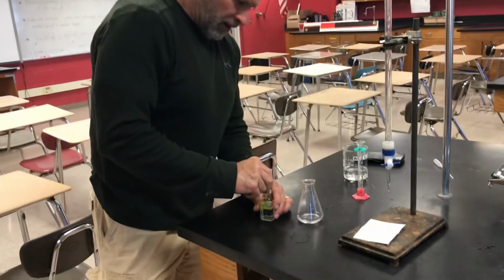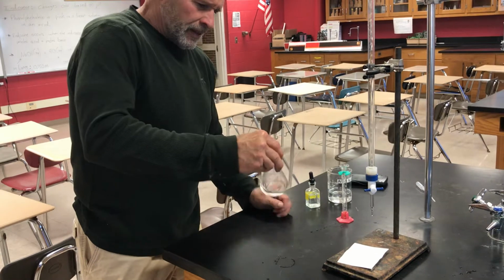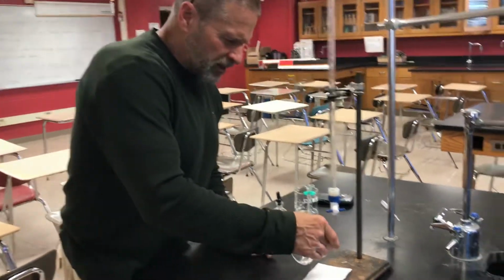A couple drops of phenolphthalein. Okay, you ready? Here we go. We're going to start titrating this thing.